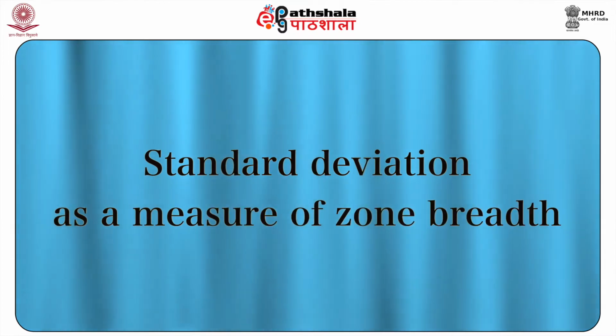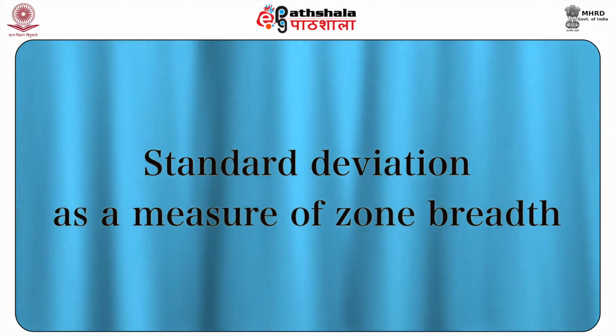Next is standard deviation as a measure of zone breadth. The breadth of a Gaussian curve is of course related to the standard deviation. Approximately 96% of the area under such a curve is included within plus or minus 2 standard deviations of its maximum. Thus, a standard deviation derived from a chromatogram serves as a convenient quantitative measure of zone broadening.